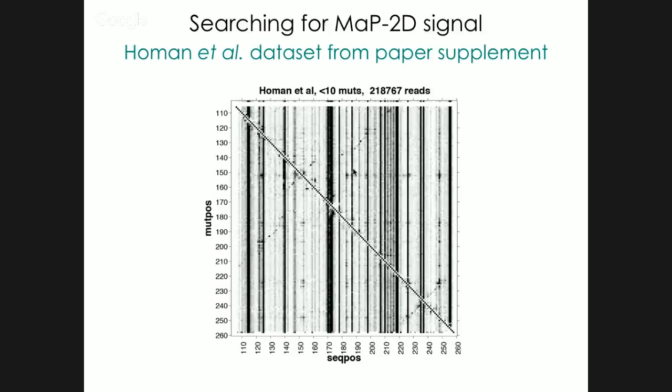As you can see, this is for the P4P6 RNA. There are clear indications of secondary structure elements that correspond to the secondary structure elements within the P4P6 RNA. And then there are also punctate spots here that correspond to alternative tertiary structure base pairing interactions, such as the tetraloop receptor that is present in P4P6. You might be familiar with that interaction because the tetraloop receptor interaction is what Joe uses for many of his initial RNA make designs.